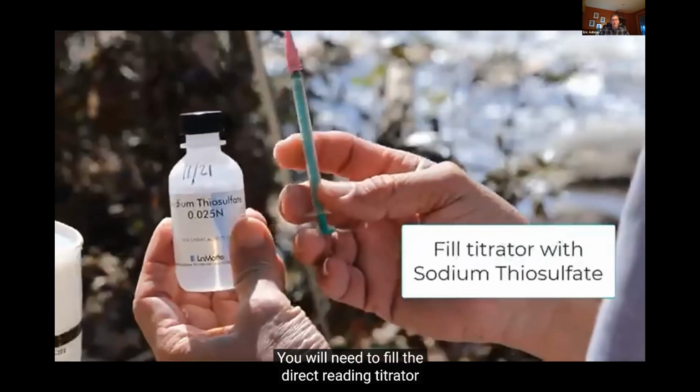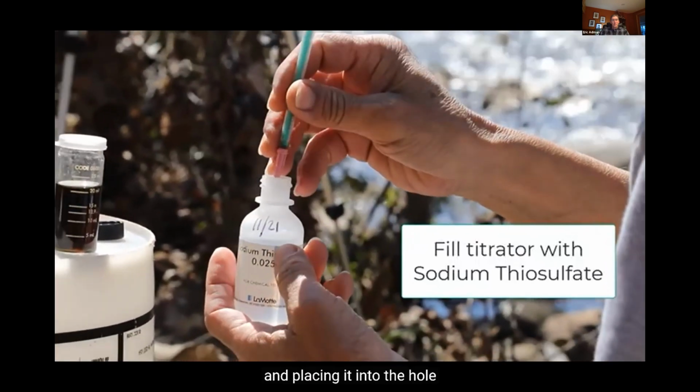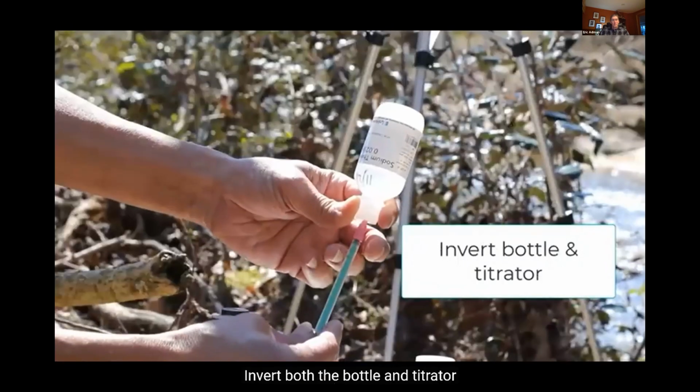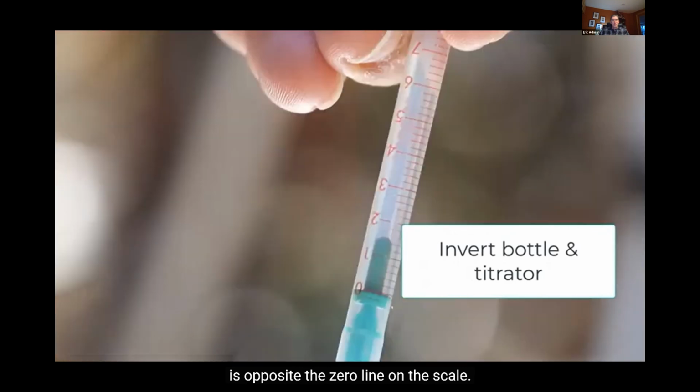You will need to fill the direct reading titrator with sodium thiosulfate by depressing the titrator and placing it into the hole in the top of the sodium thiosulfate reagent bottle. Invert both the bottle and titrator and draw out the titrant until the large ring on the plunger is opposite the 0 line on the scale.